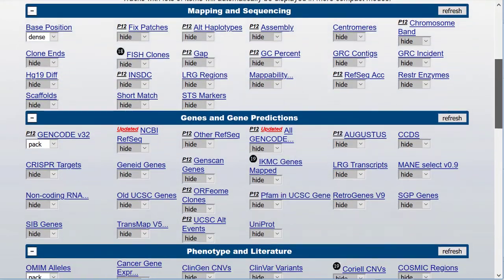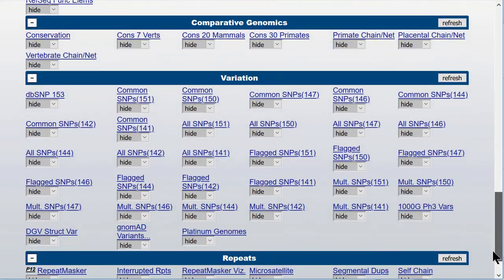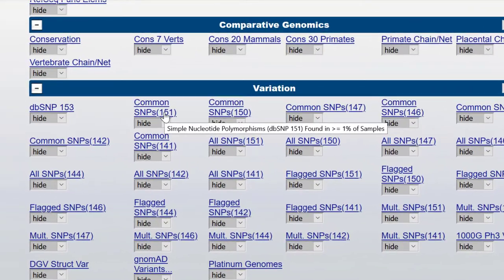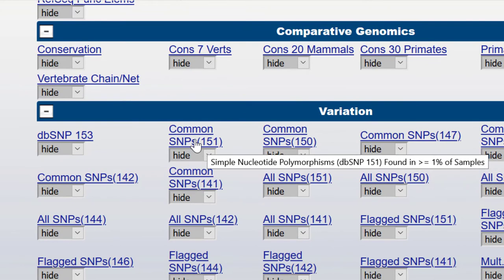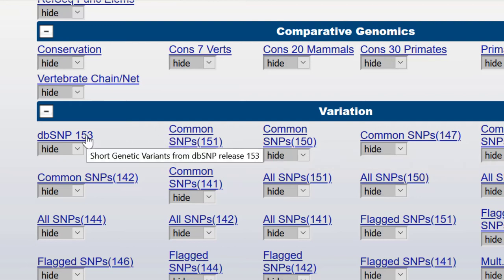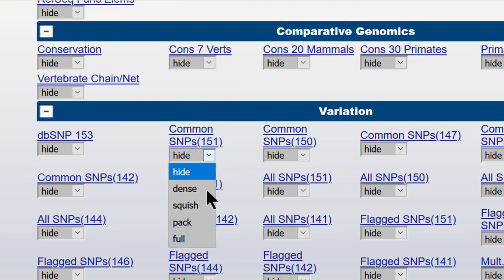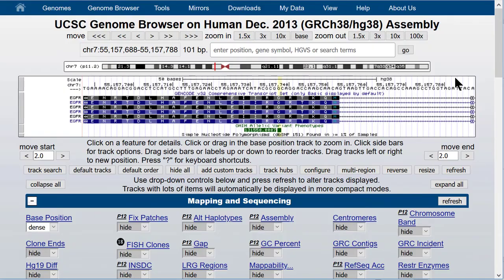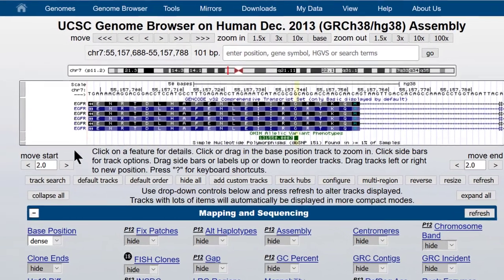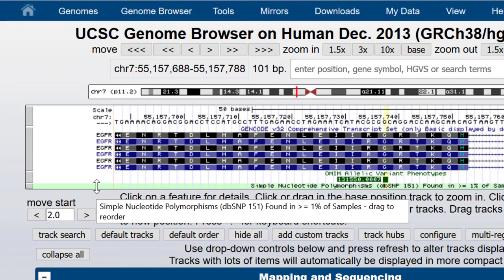Let's pick up an RSID from dbSNP and use that for navigation in a link. RS is reference SNP — though these days it is more fashionable to call them SNVs rather than SNPs, as the word polymorphism has implications, specifically that minor allele frequency is above 1%, which does not apply to most of the variants in the database. But SNV is difficult to pronounce and many people use SNP synonymously. The most recent release, SNP153, is a composite track — a more complicated situation which we will discuss in a later video in this series. We'll turn on the common SNP151 track, though in an exon of an important gene we would not expect to find many common SNPs. As expected, we find no common SNPs in this window, so let's zoom out by 100x.